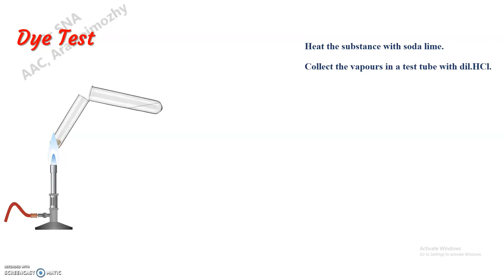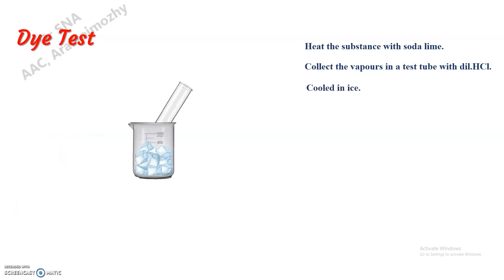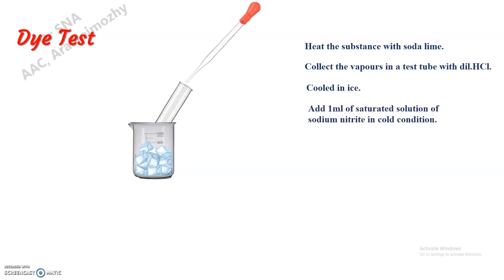Then we have to keep this test tube in ice — that is, we have to cool it in ice — and now we have to add a saturated solution of sodium nitrite in this ice cold condition.